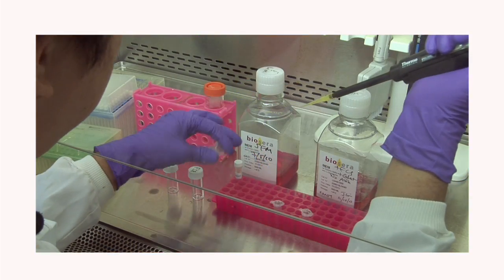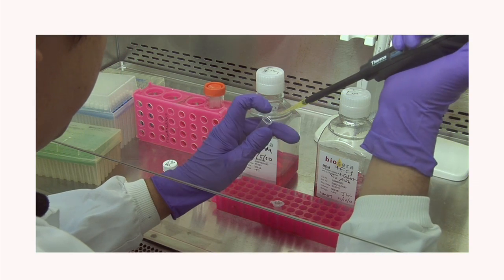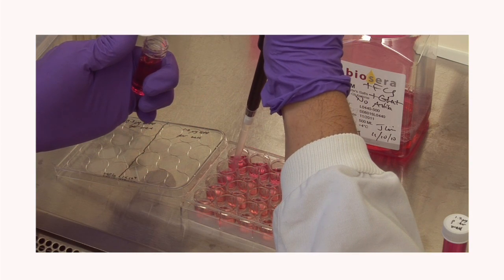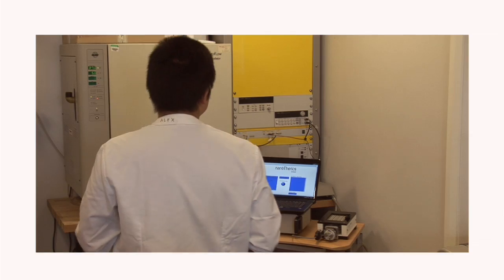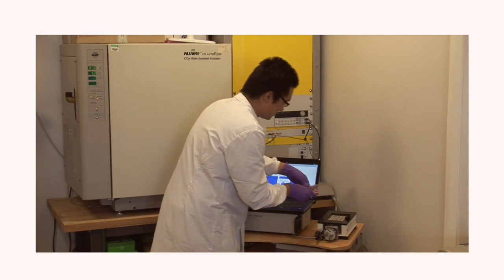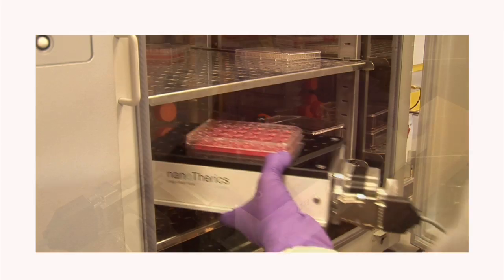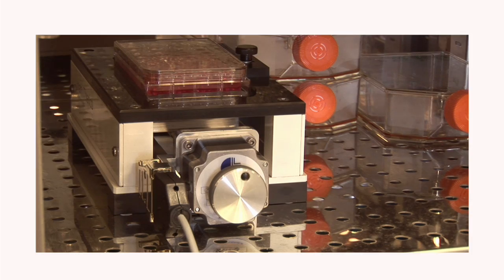Briefly, a solution of DNA and the NT-Mag magnetic nanoparticles are mixed to form a complex and this is then added to cells in a regular tissue culture plate. The plate is then placed on the Magnifect Nano sample holder for approximately 30 minutes in a cell incubator to allow transfection, after which the cells are cultured as per standard techniques.